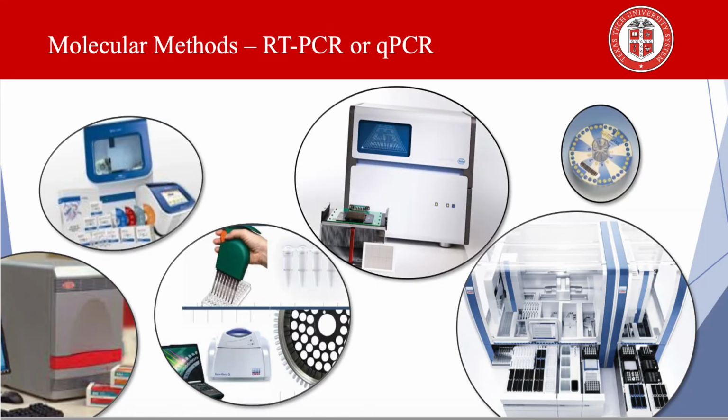PCR technology was limited to qualitative and/or semi-quantitative analysis due to limitations on the ability to quantitate nucleic acids. At that time, to verify if the target gene was amplified successfully, the DNA product was separated by size via agarose gel electrophoresis.